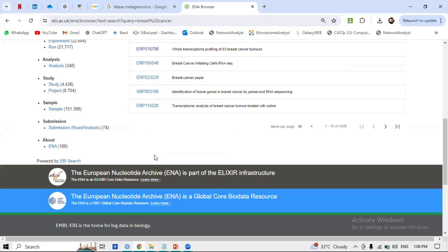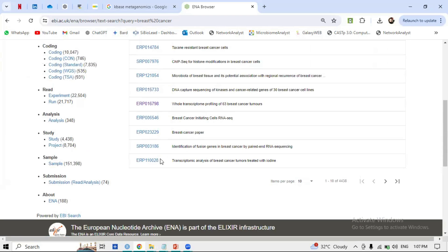A simple explanation: if you are Ali and you conducted RNA-seq NGS and generated 20 files, you can share those files into the ENA database with a heading describing your analysis. For example, studies titled 'Breast Cancer Initiating Cells RNA-seq' or 'Whole Transcriptome Profiling' — these are titles of studies. Let's click on one of them.